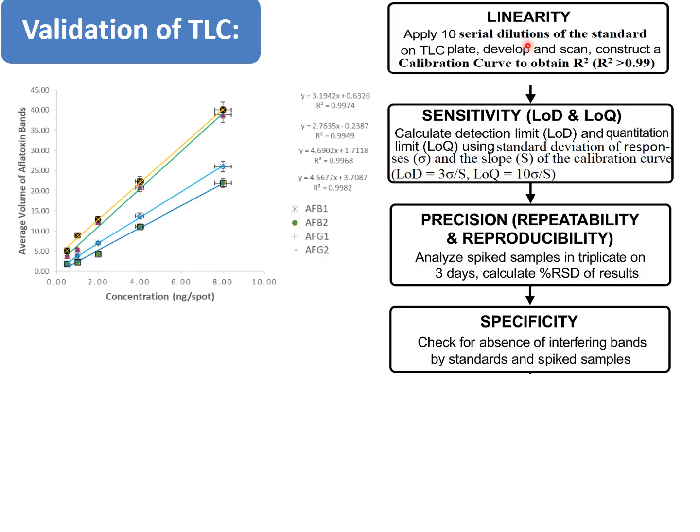In simpler terms, specificity is the method's capacity to distinguish the target analyte from everything else in the sample.